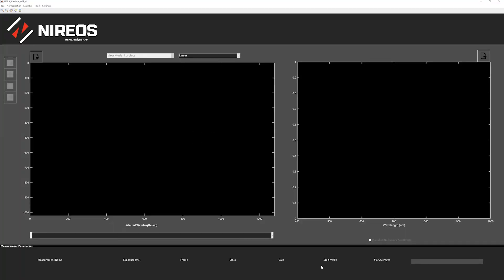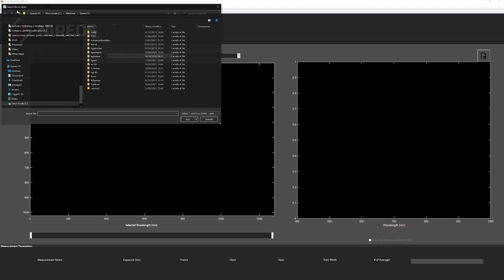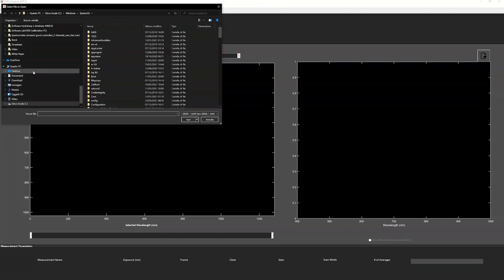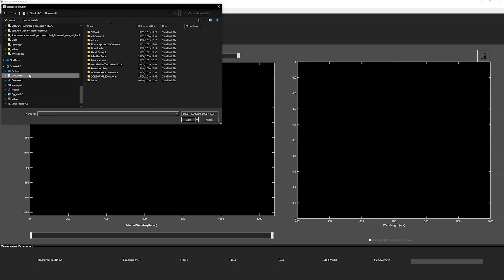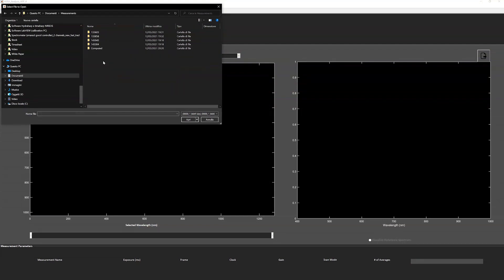This is the analysis software for analyzing the data that we have just measured. It's called the HERA analysis app. We can go to file and load raw data, and we can go and select the data that we have just measured.